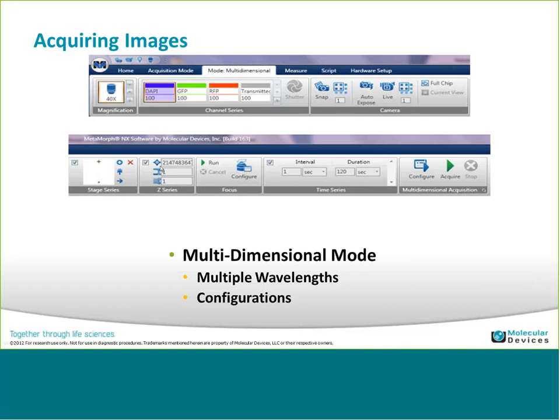Now, the other question you had was, is there an option for a top and bottom setting for Z acquisition? Yes, there is, but it has to be done through a Python script, and I have one available that I can give to people. When you run the script, it pops up a dialog that allows the users to start a live view, adjust the focus to find the top position and set that, then adjust the focus to find the bottom position and set that.